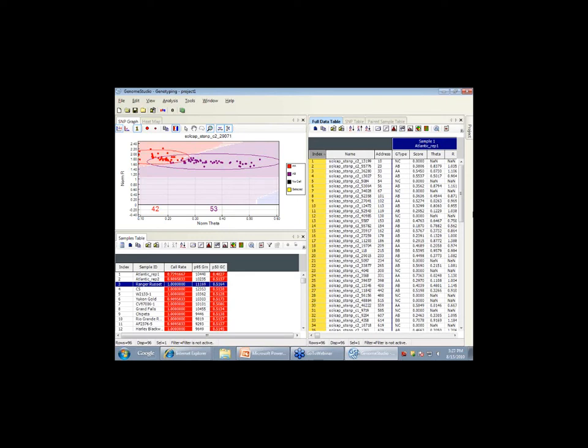Oh, as far as annotation, you mean? In this software you can actually annotate SNPs, but I don't think this would be the best spot to do it, to be honest. You're better off to get your genotypes and use something more integrated, as the tools develop on that.